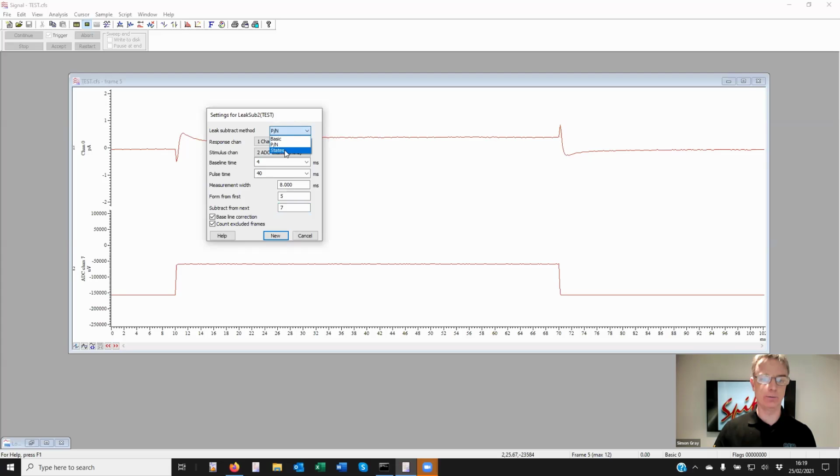And the other method of specifying is to use states. So the chances are there will be certain states you use during sampling, a set of stimuli that you know wouldn't produce a response from the voltage activated channels, and you can specify what that state is in the dialog here. So whenever it comes across that state, it uses it to modify its definition of the leak.